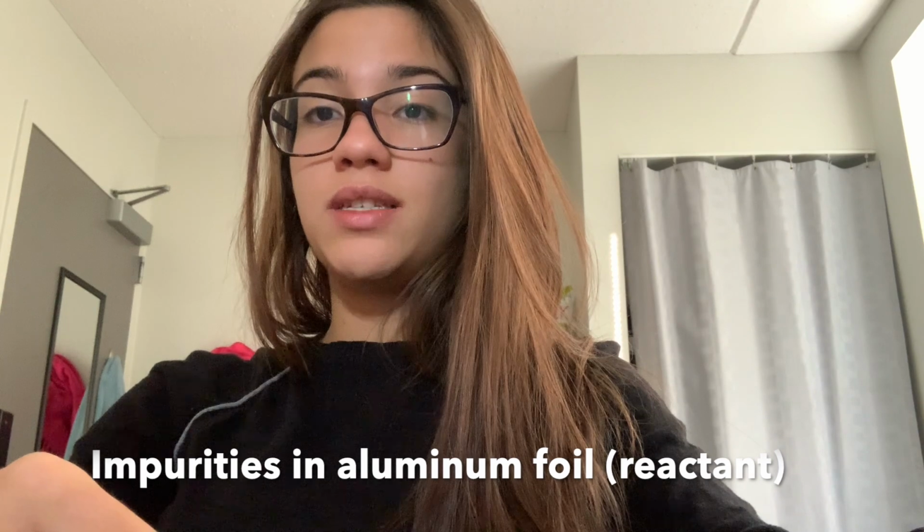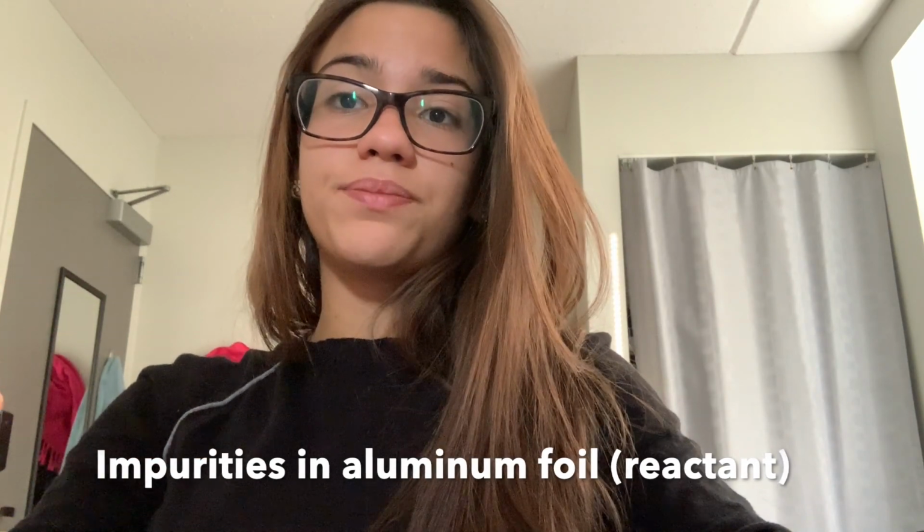Another detail is that the aluminum foil sheet is not pure aluminum. It could have contained impurities as well as other metals, but we still measured it as 1 gram. So it could have been 1 gram of other kinds of metals and other impurities that we didn't factor into our amount that we used to calculate our theoretical yield.